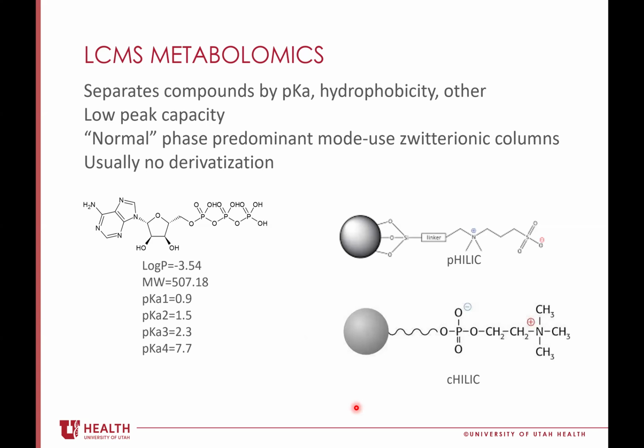And then stuff like absolute GSH versus relative reduced to oxidized glutathione profiling, is that pretty robust? Yeah, so we have an approach for that. We take a sample and process it under conditions where GSH is not going to dimerize to GSSG. We extract it and then immediately derivatize the free thiol, which prevents the cross cysteine bonds and allows us to get the GSH to GSSG ratios. We'll also add an internal standard if we really want absolute quantitation. We can also use that internal standard to see how effective our derivatization technique was.